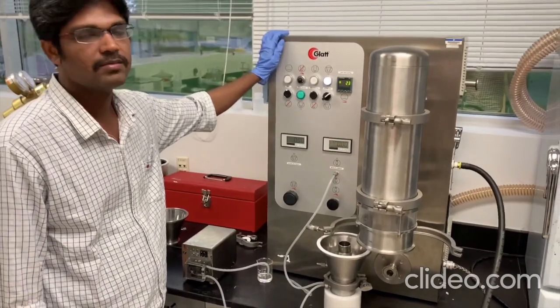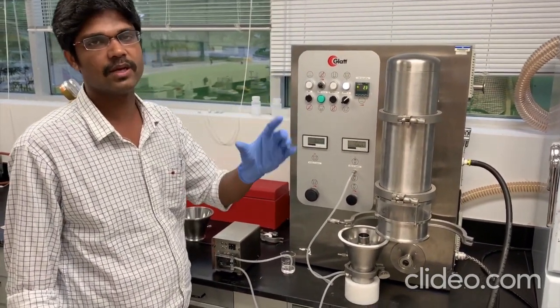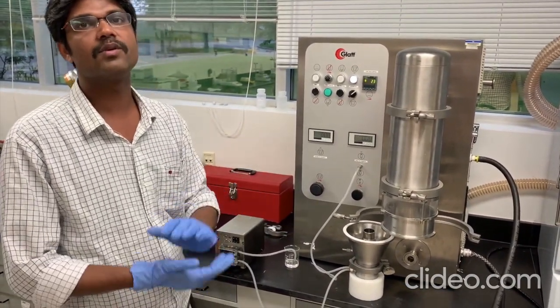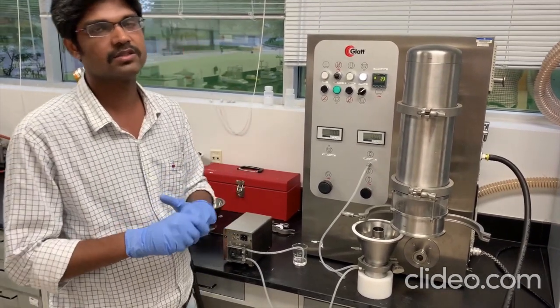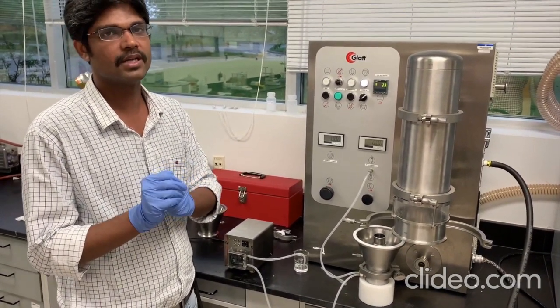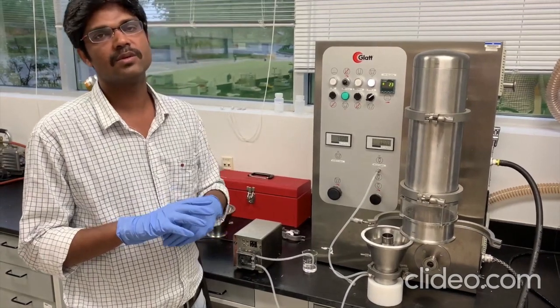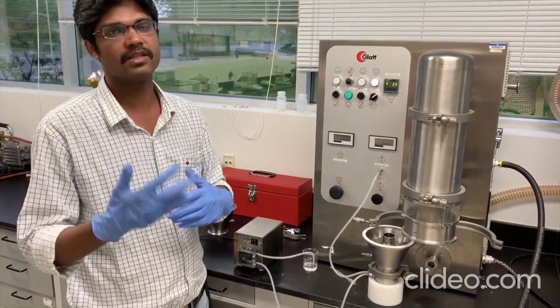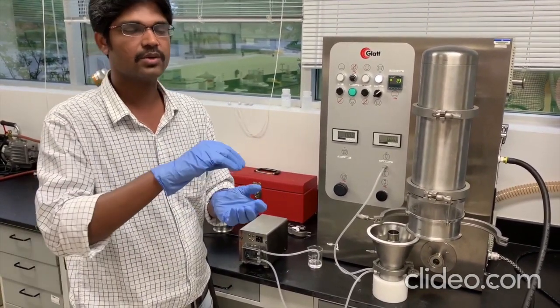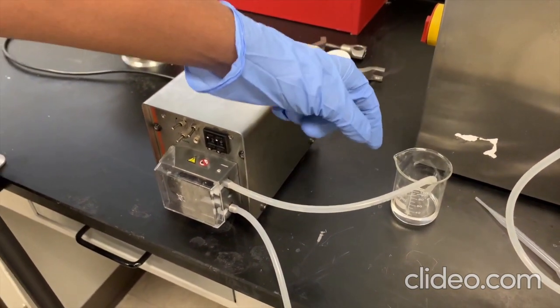This is the Glatt coater machine which I use for the coating of these yttria-stabilized zirconia particles. Before coating the particles, we have to make the polymer solution. I use polysiloxane as a coating material, which is dissolved in a pentane solvent. Pentane has been chosen because it can be evaporated with temperature. At nominal temperature, around 60 degrees Celsius is sufficient to evaporate this pentane. Polysiloxane has been dispersed in the pentane solvent.